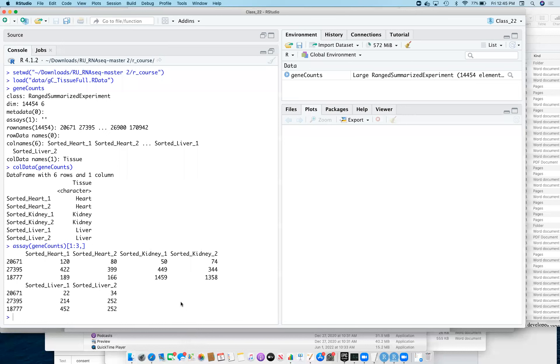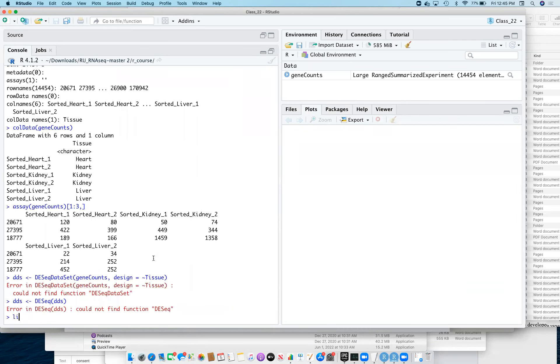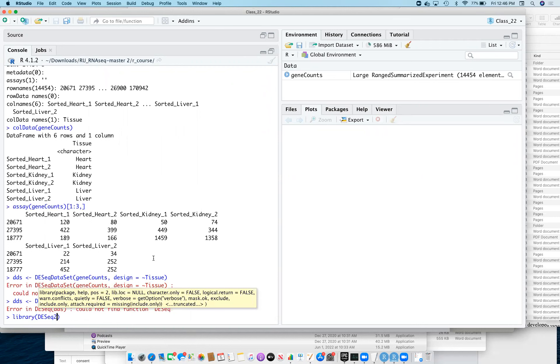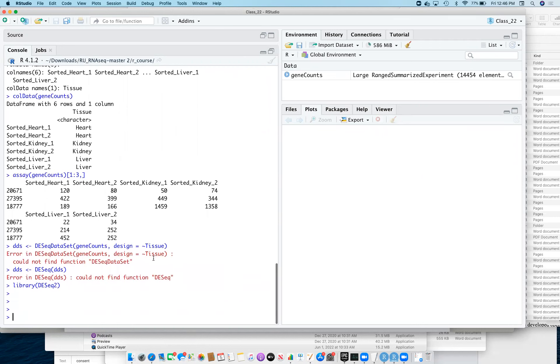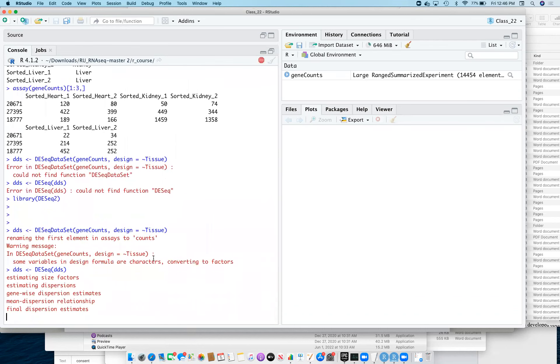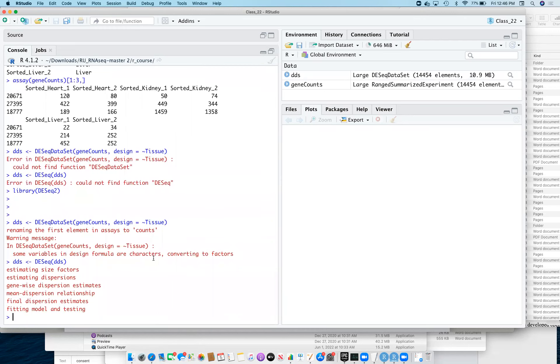Then we run the DESeq workflow — it will go off and do the normalization. Oh sorry, I need to load the DESeq2 library first. So that will go off and run our estimation and normalization, which is estimating size factors. It calculates our gene-specific variation — so each gene is variable across samples. It then uses the mean-dispersion relationship: higher mean values, less variance; lower mean expression, more variance. Then it calculates the final fitted dispersions and fits the whole overall model for our data.